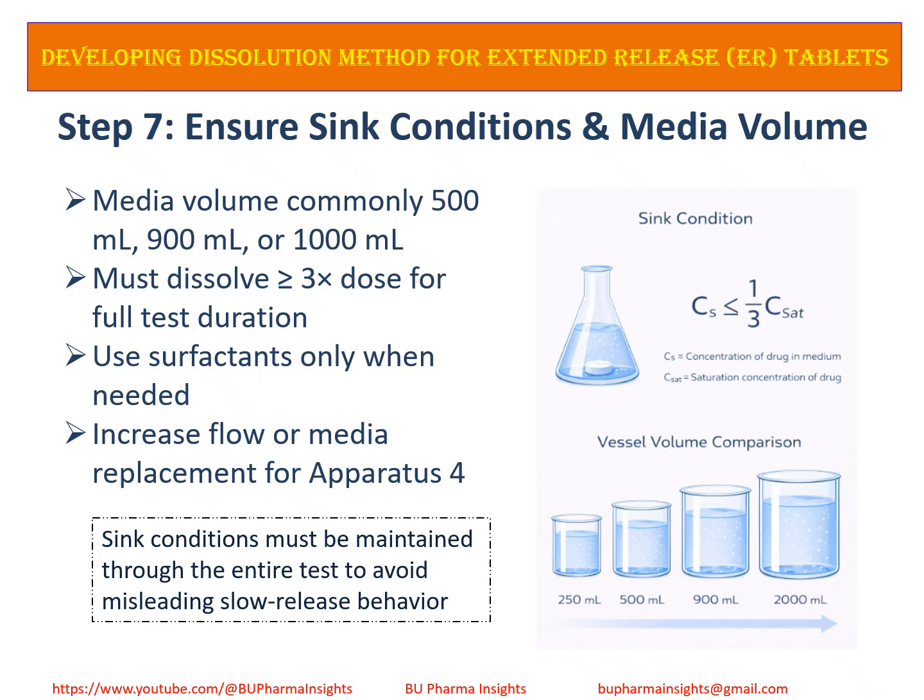If sink conditions are still not met, use surfactants only when truly needed and scientifically justified, or switch strategy: increase flow rate or use media replacement with apparatus 4. The goal is to maintain constant dissolution driving force without masking formulation differences.